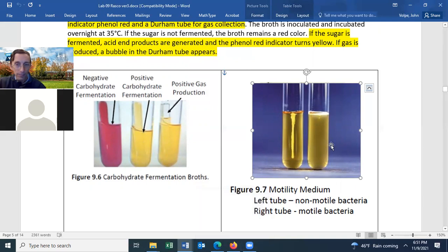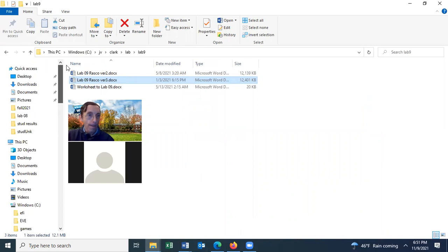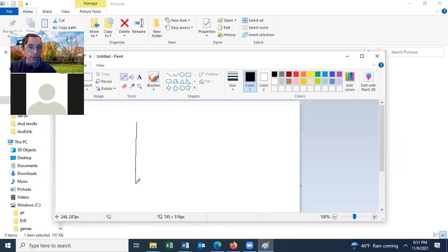And let me draw you a picture. So here is the tube. Make it nice and wide. And there's the stab. If the bacteria grow out from the tube, and they usually are rounded, and they'll be on this side too. If they flare out from the stab, then they are motile, slightly motile.